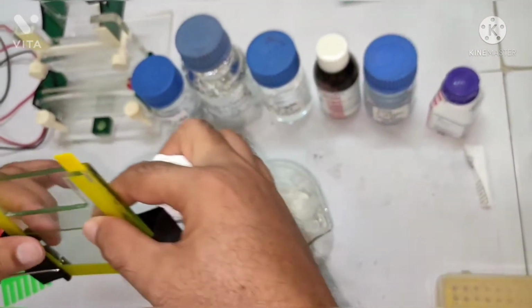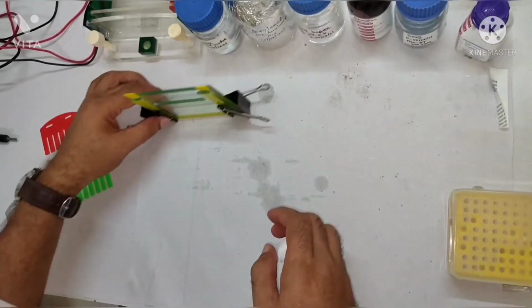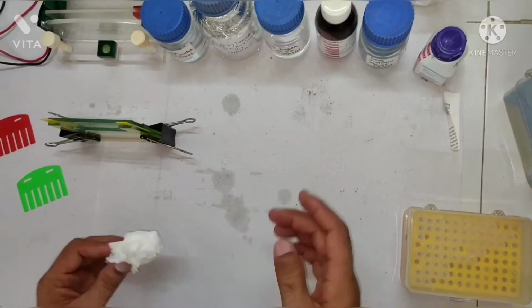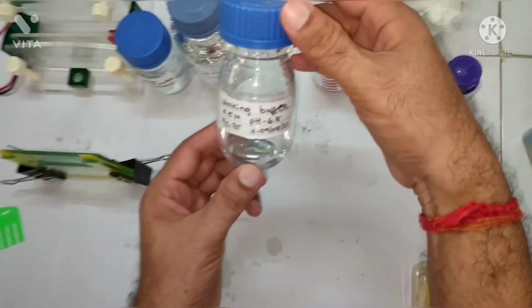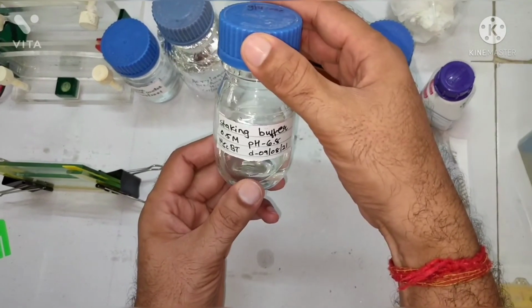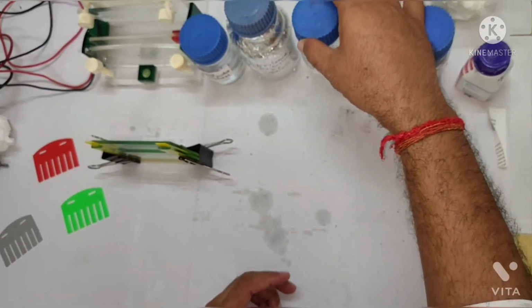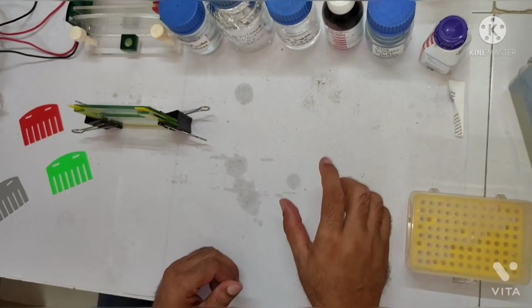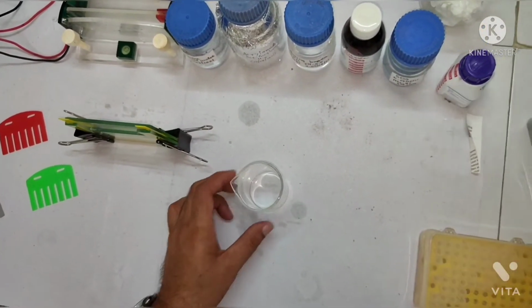Okay, so now we cast the stacking gel. For the stacking gel the chemicals are almost the same, but the concentration and amount would be different. The separating buffer is replaced by the stacking buffer, which is 0.5 molar and pH 6.8. So now we cast the stacking gel.